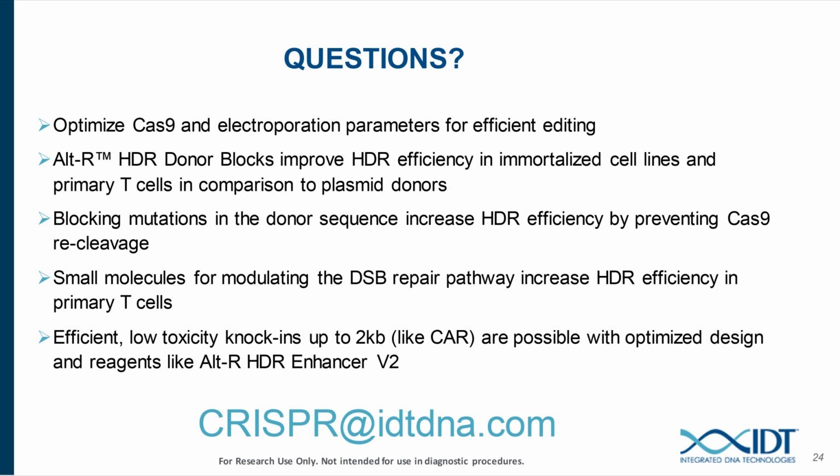It's certainly doable. We haven't tested it in primary T specifically. We've done all of our optimization with RNP delivery, but there is some web material on IDT's website that can make suggestions on how to use Cas9 mRNA and Cas9 plasmid.